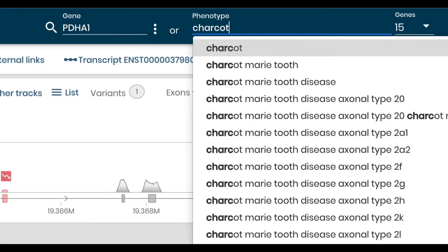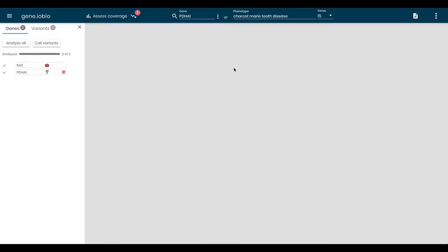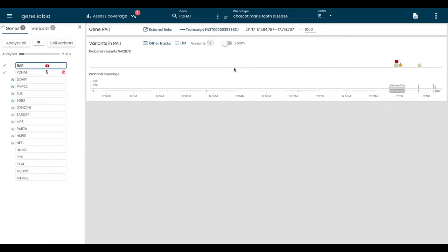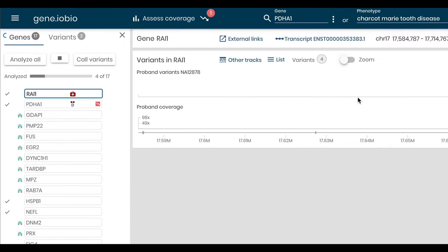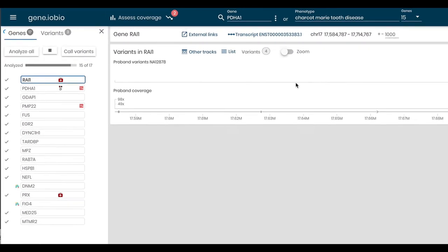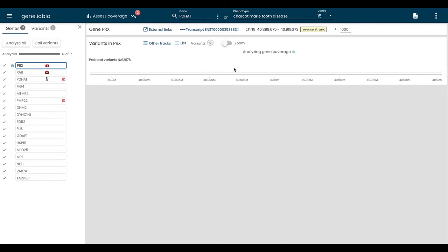Gene.iobio is a powerful web application in the iobio family of tools that focuses on understanding both alignment and variant data in genes, specifically for small nuclear families.